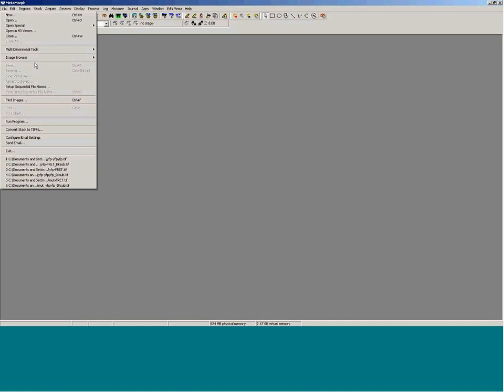The initial images that we're dealing with are coefficients. This is the CFP-only sample that was imaged with the CFP excitation, CFP emission. This is the CFP-only sample that was imaged with the CFP excitation and YFP emission FRET combination. These are the raw images that were acquired, and we're looking at the background subtracted images here. I'll show you additionally why it's important to do background subtraction, because of how it will adversely affect the overall coefficient calculations if you don't do it.